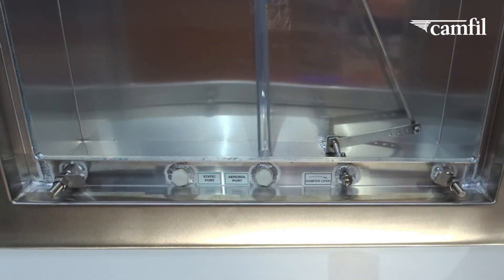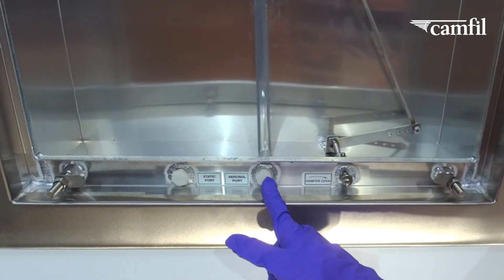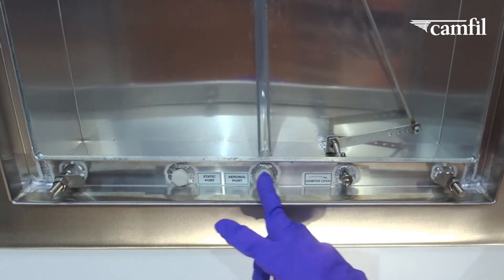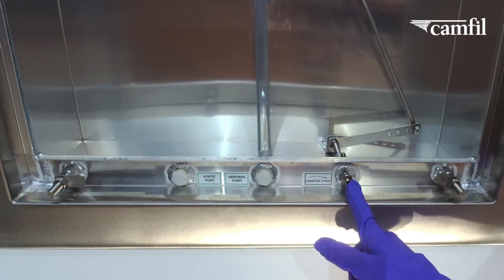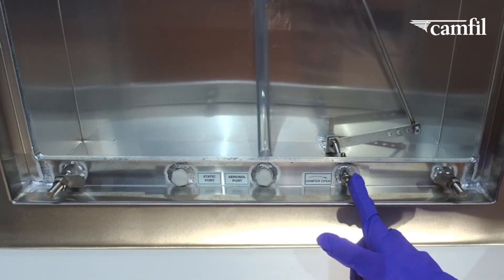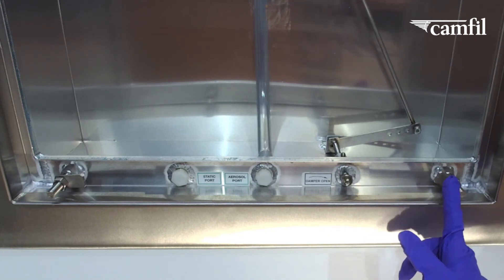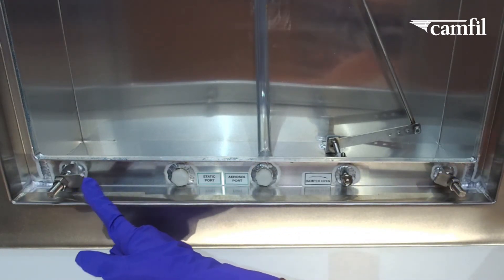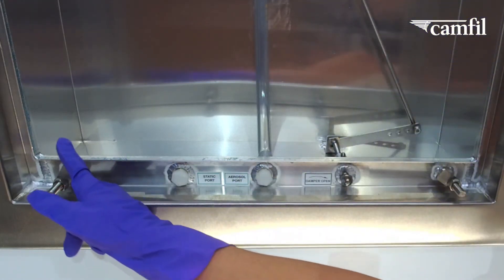The PharmaSlim Terminal housing features room side access for your static pressure and aerosol injection port with a standard connection. You also have room side damper adjustment capability of the Bowtie damper, which comes as the standard option on this housing. Your manual filter clamps are here, and you can also see the knife edge that sits in the gel track.